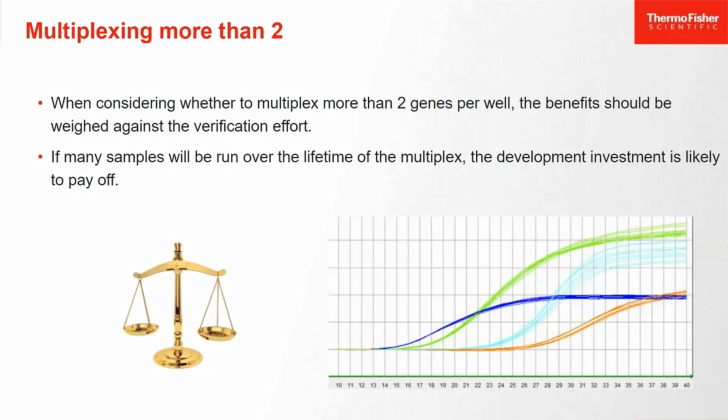So when considering whether to multiplex more than 2 genes per well, I suggest weighing the benefits versus the verification effort. Now, if the plan is to run many samples over the lifetime of the multiplex, that development effort is likely to pay off.